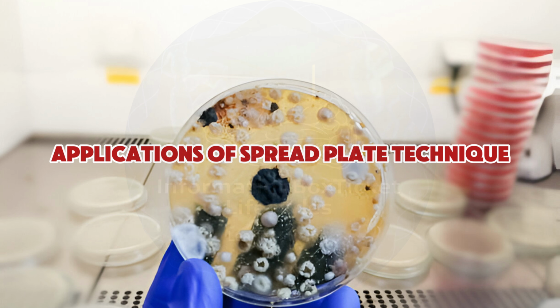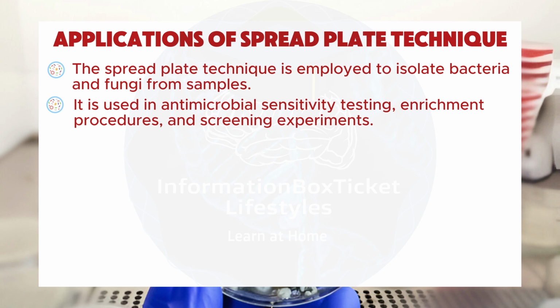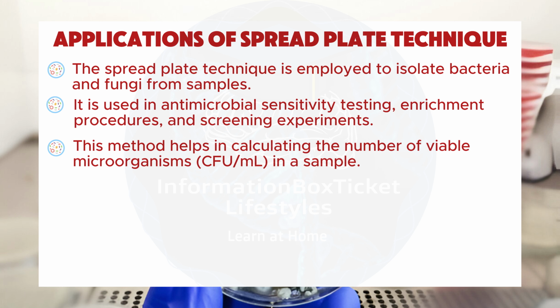Applications of spread plate technique. The spread plate technique is employed to isolate bacteria and fungi from samples. It is used in antimicrobial sensitivity testing, enrichment procedures, and screening experiments. This method helps in calculating the number of viable microorganisms, CFU/ml, in a sample.